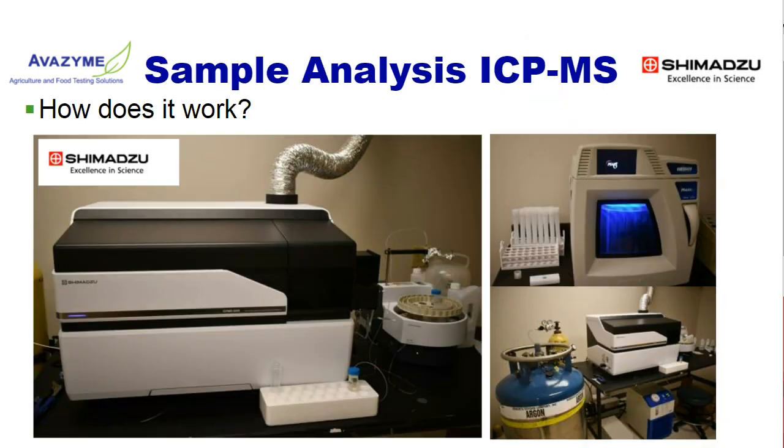So let's talk about ICP-MS spec. How does it actually work? What you see depicted here on these pictures is actually our instrument in our lab, equipped with an autosampler. And I'm also showing you the Mark 6 microwave digester on the right-hand side that we will talk about in more detail.